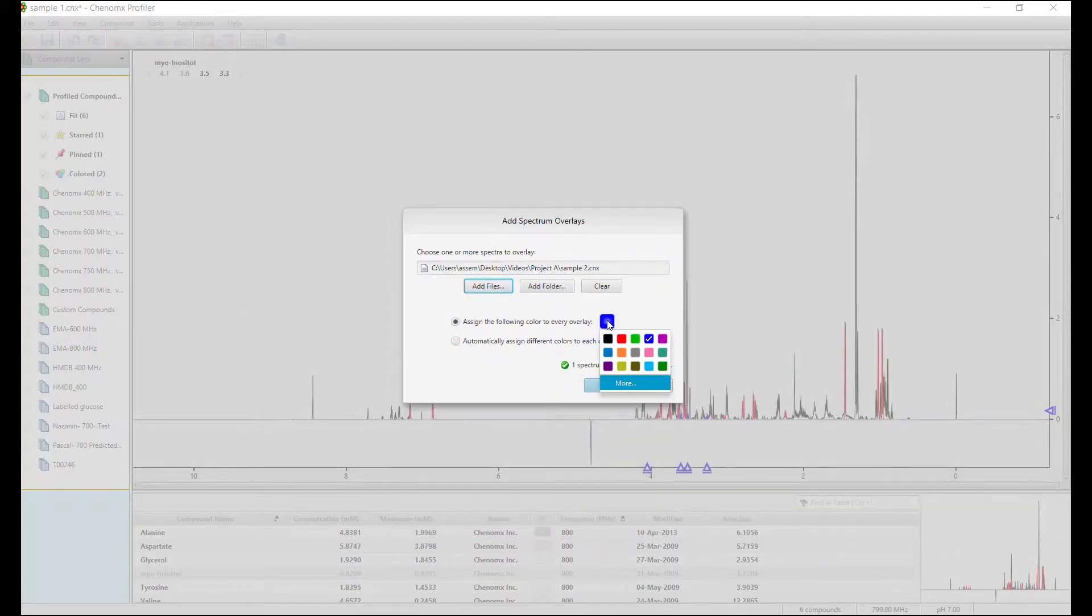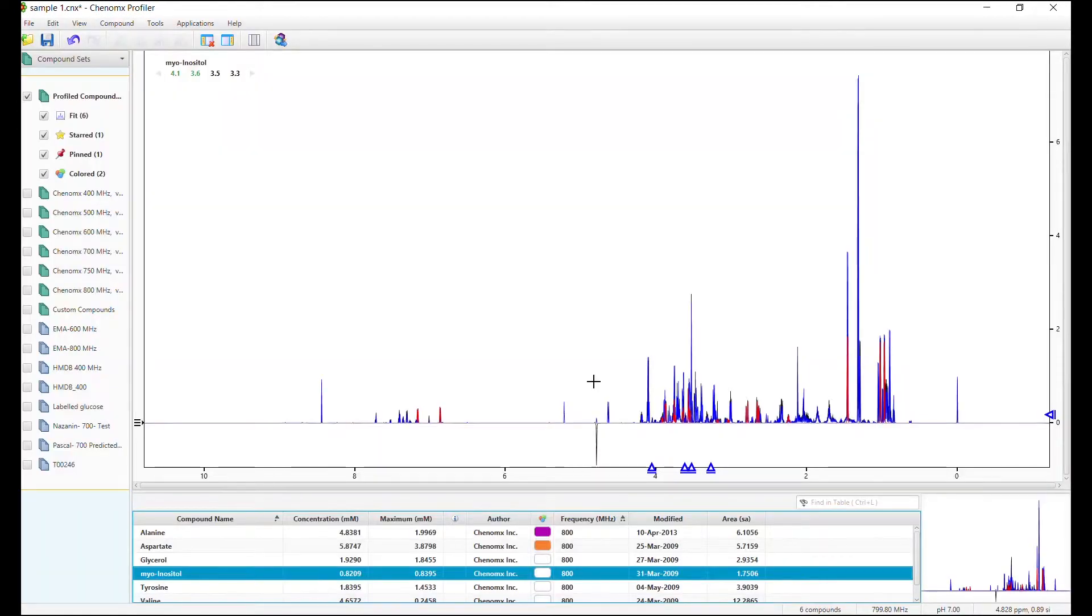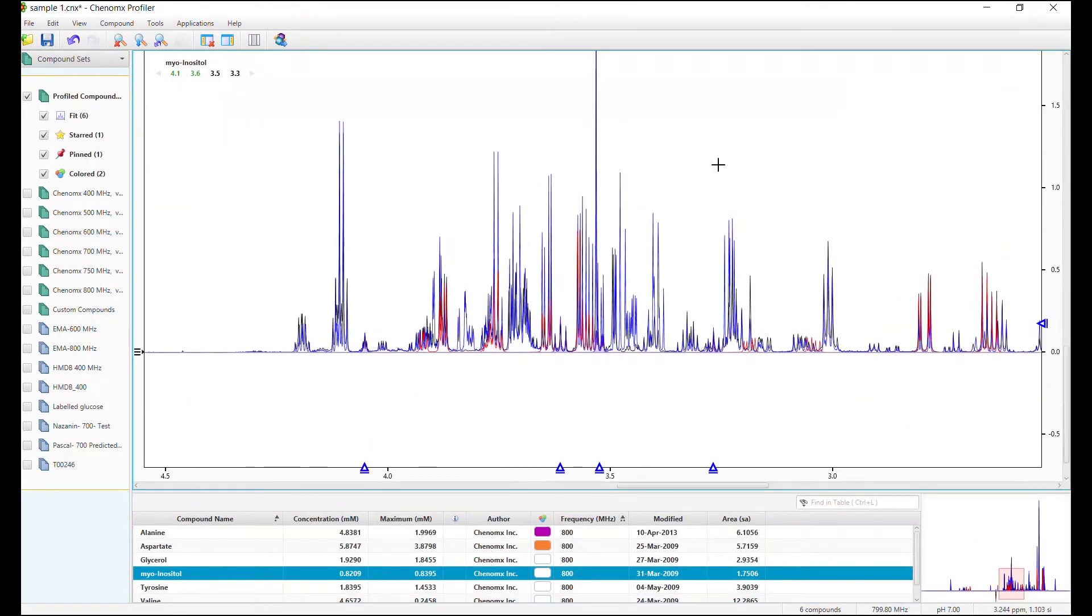Choose a color for your CNX file. Now zoom in and you can see the overlaying spectrum and compare with your sample spectrum.